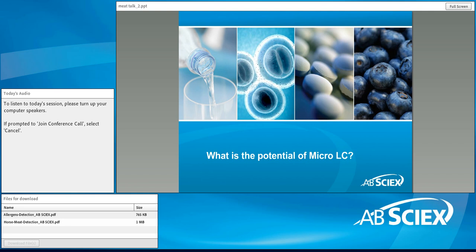So at that point I designed my MSMS method, and the next thing I wanted to do was set up a full LCMS screening method, and I went to use micro-LC. Now, one of the things micro-LC gives you is that you're running samples at a much lower flow rate, which gives you sensitivity increases. If you look at discovery proteomics, a lot of which is done in academia, in shotgun proteomics, for example at the ETH, they often use nanospray, because nanospray is well known to give you sensitivity increases in protein and peptide ID.